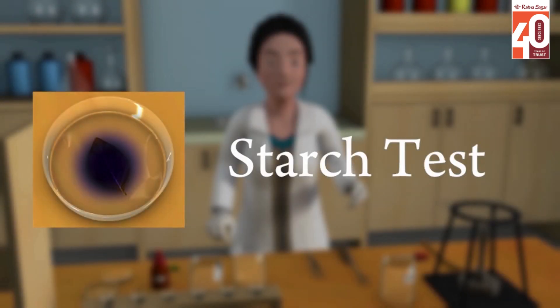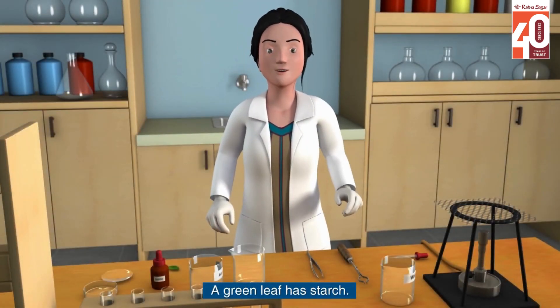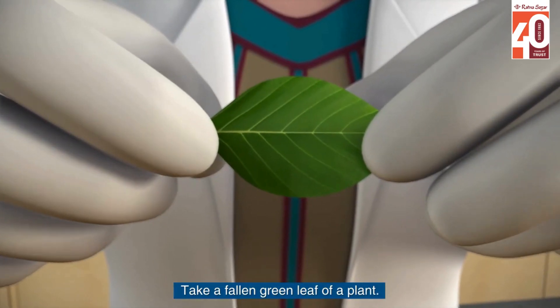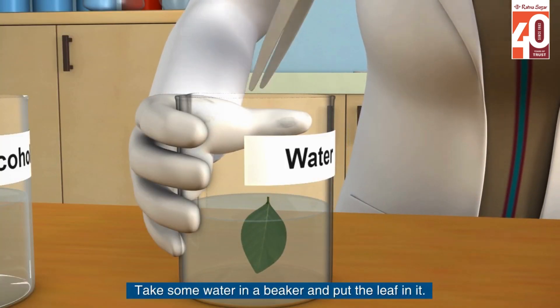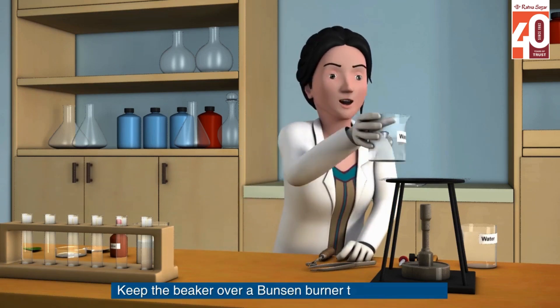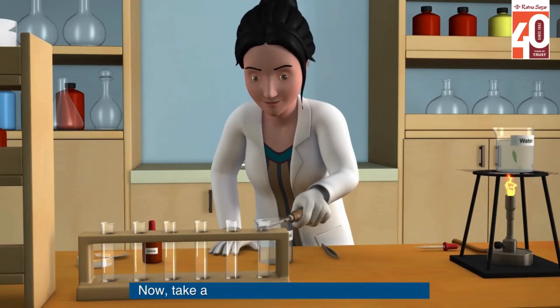Starch test: a green leaf has starch. Take a fallen green leaf of a plant. Take some water in a beaker and put the leaf in it. Keep the beaker over a Bunsen burner to boil the water.